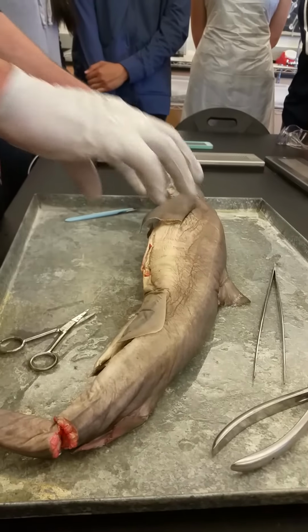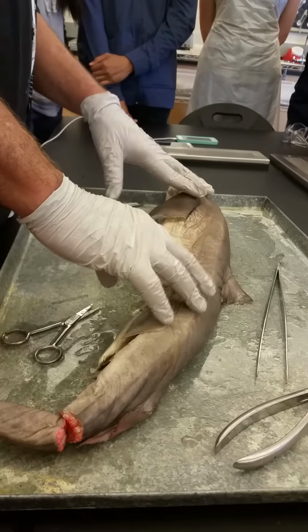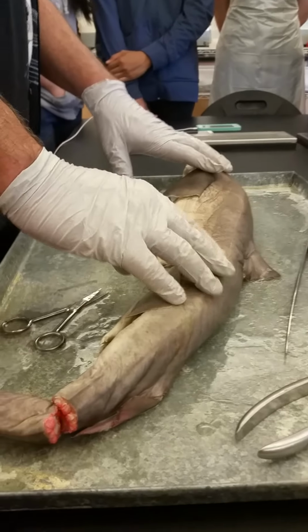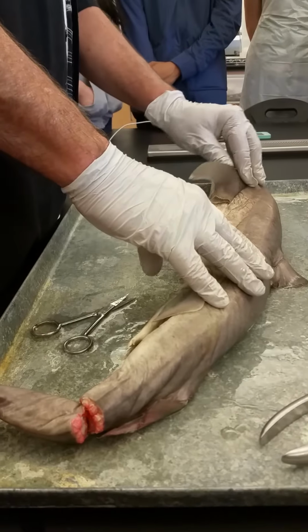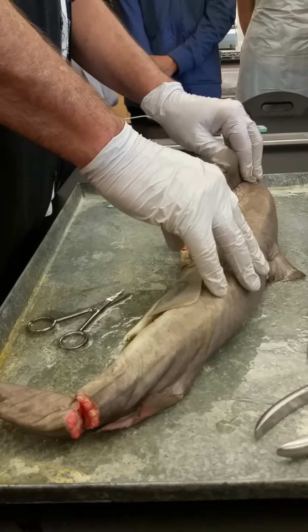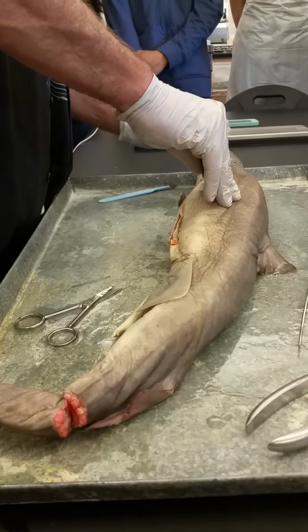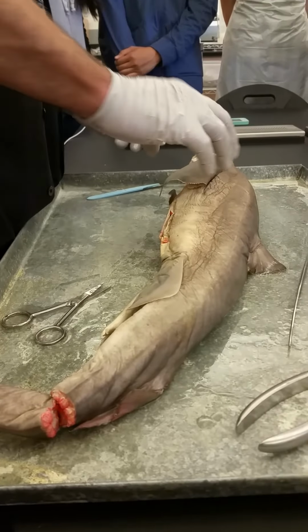In terms of olfactory systems, sharks have very sensitive olfactory systems, much more so, in general, than the bony fish. These things can smell fish blood from miles away. They can track it, trace that track like a little bloodhound, for long distances. In some cases, it's believed they can actually smell their way home to a home lagoon when it's breeding season, although salmon can do that as well. So a large portion of their brain is devoted to an olfactory system, in proportion to the bony fish, which would have more of their brain devoted to their visual system.